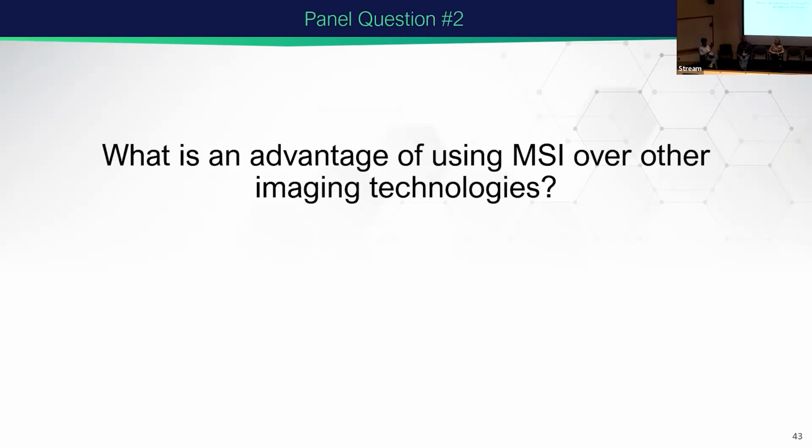Yeah, definitely so. That's actually a really good point, that everything is not going to be in vivo at that point. You're exposing it to organic solvents, whether these are strong acids, bases, anything in between, or embedding them into different cellulose. It's really hard to do that in vivo. So you have to design your experiments, whether they're time point studies or anything in between, that leaves large gaps where modeling or maybe some other techniques can fill in a lot.